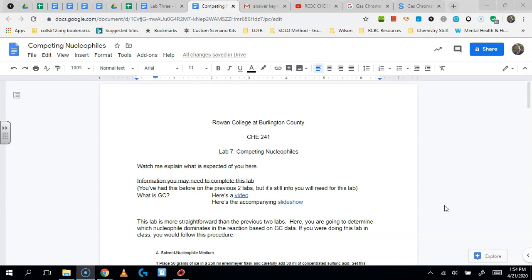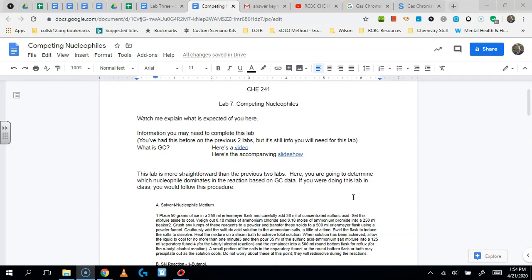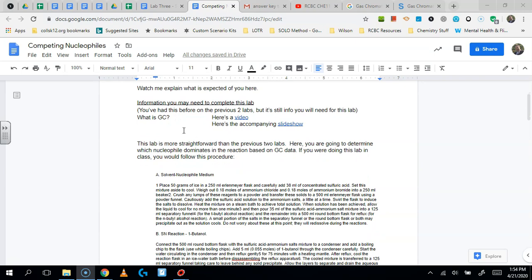Hey everybody, I just wanted to spend a little bit of time going over the last lab of the semester here, the Competing Nucleophiles Lab. Even though this is the fifth lab that you've completed, or that you will be completing, it's numbered Lab 7 from an old numbering system, so don't worry about that. This lab is going to rely heavily on your knowledge of GC.